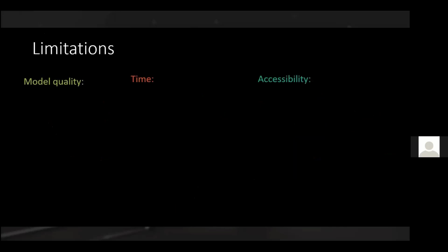Now, in particular for this audience that might be interested in using this device, or well, potentially using this device for research, I thought we should briefly say that there are still some meaningful limitations. There's limitations in specimen size. I briefly noted this. The small size is to some extent just controlled by optics. So if you have multiple lenses available, that is addressable. The large size is currently limited by the dimensions of the scanner. So if you build a scaled up version, larger sizes are possible, but with the system that's currently built, I think it's between 5mm and 8cm is the maximum size.